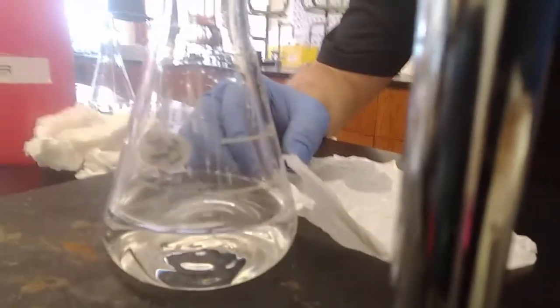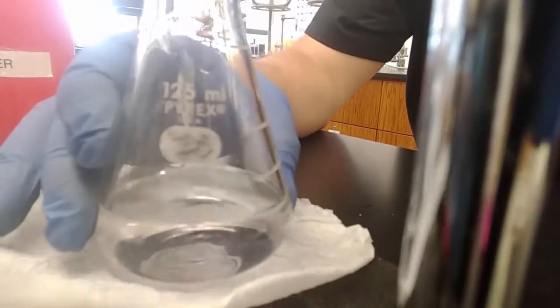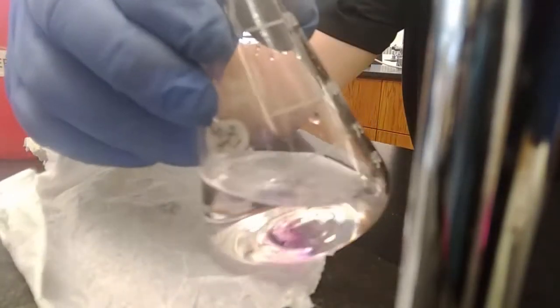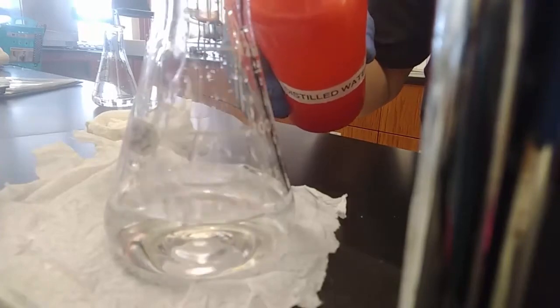Now, swirl, still colorless, as expected for not quite adding the right amount. Now let's see if I can really this time get it done with one drop to turn it from clear, colorless, to clear and pink. So we'll do one drop at a time, very slowly. Ooh, see that drop went on the edge there? I have to wash that down. In fact, let's wash that down now just to be safe. Okay, I washed it into the flask with my wash bottle. Rinse off the tip too. Here we go. Let's lower this in so that we're certain to not miss.